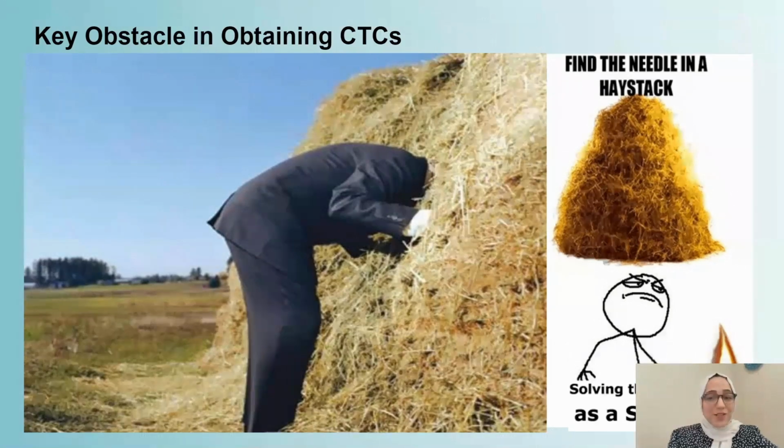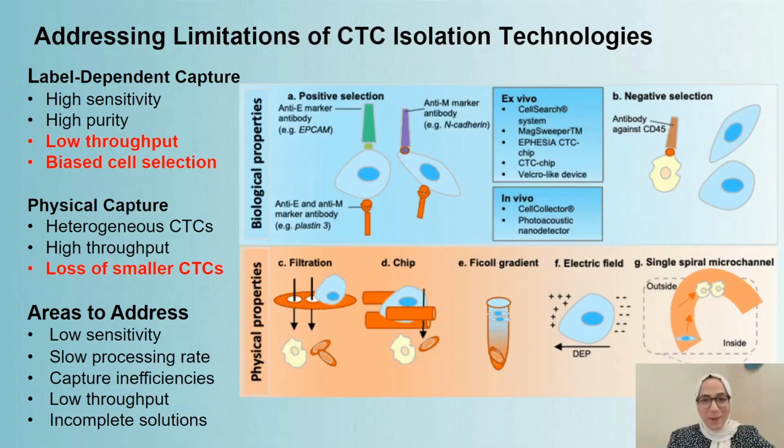However, they are extremely rare, only a few CTCs per billions of blood cells, thus making their isolation and characterization a tremendous technical challenge. So as you can see here, it can be like finding a needle in a haystack. So let's solve the problem as scientists, but unfortunately, we cannot burn this haystack.